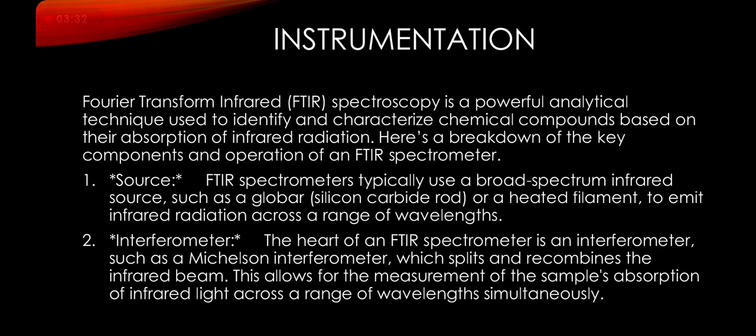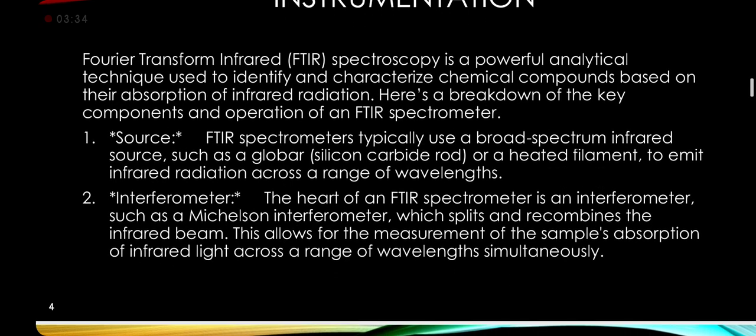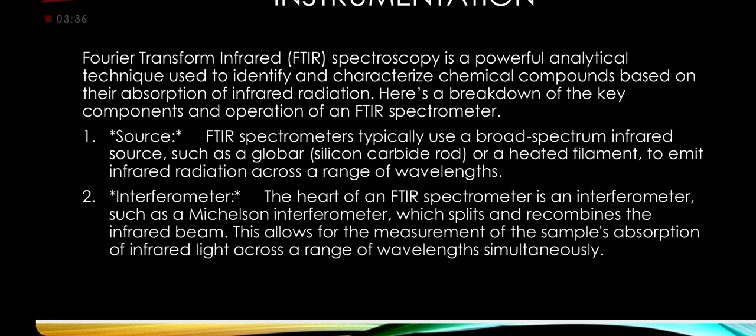Interferometer. The heart of an FTIR spectrometer is an interferometer such as a Michelson interferometer, which splits and recombines the infrared beam. This allows for the measurement of the sample's absorption of infrared light across a range of wavelengths simultaneously.